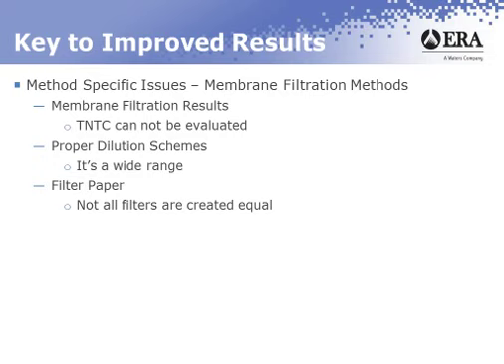If you don't get any absorption of the media, that means that any organism that's seated on the filter in that area does not have any food to grow. That obviously will affect your results. It's not going to develop a colony that's going to be countable. So if you get kind of a tie-dyed look to your filter paper, it's very possible that you got a bad batch.